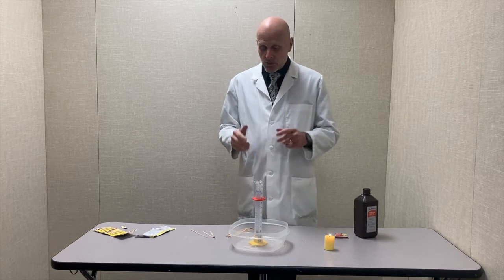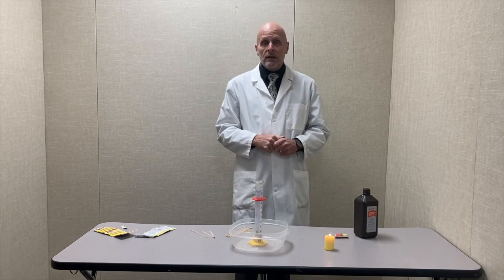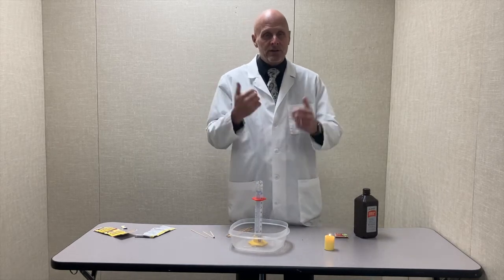How many times can you get that to relight? I saw a student one time do this 100 times by producing so much oxygen that it kept relighting over and over again.